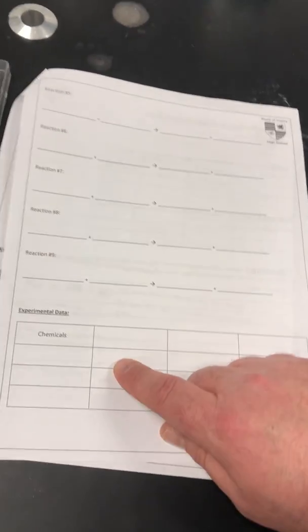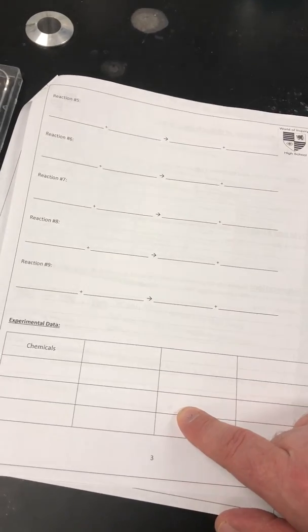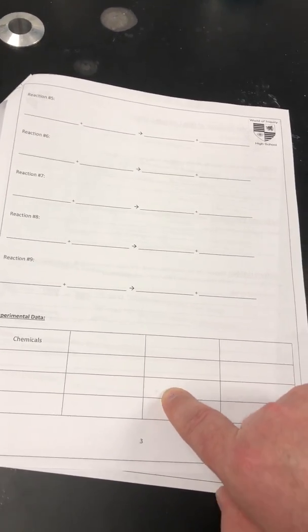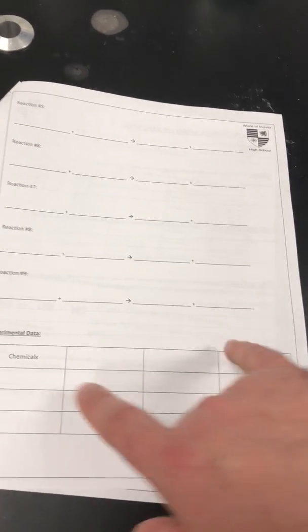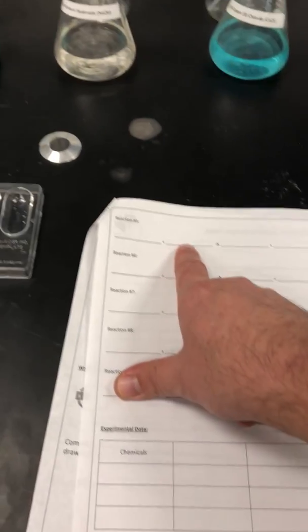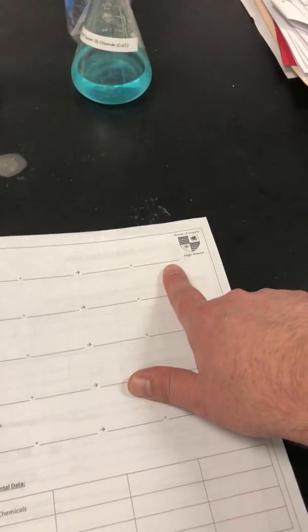Now this box 1, well, let's skip to box 5, because that's on this page, so I don't have to do a lot of flipping around. Either way I number it, this is going to end up being box 5. So it's going to be this chemical plus this chemical. You're going to take your 2 starting chemicals, right here. Those are my 2 reactants. You're going to perform the double replacement first.